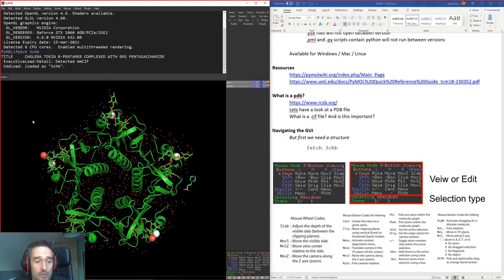The majority, as I say, come from X-ray crystallography. With X-ray crystallography there are crystal contacts which occur in order to generate your repeated lattice unit, and that can mean that some of the atoms are in places that they would not normally be if the protein was just in solution. So you have to bear in mind that there are little caveats such as that.